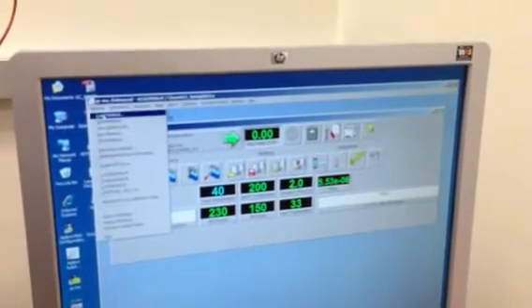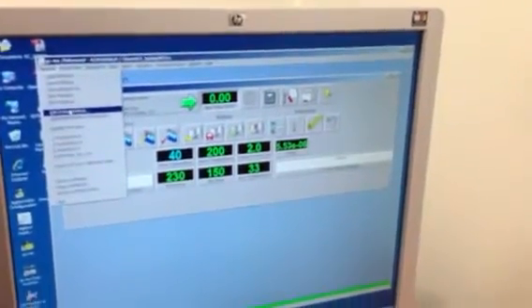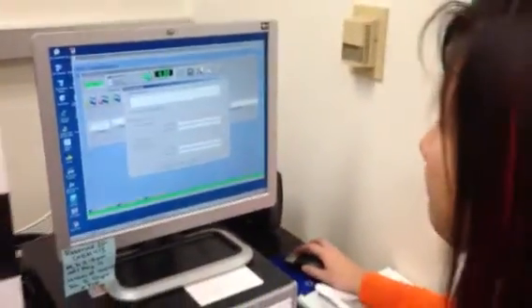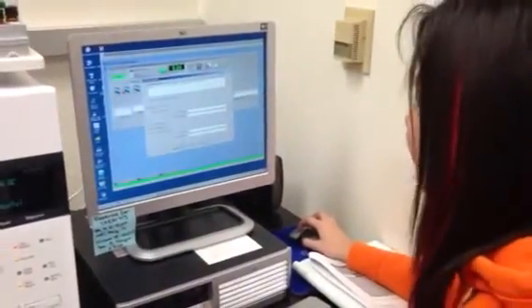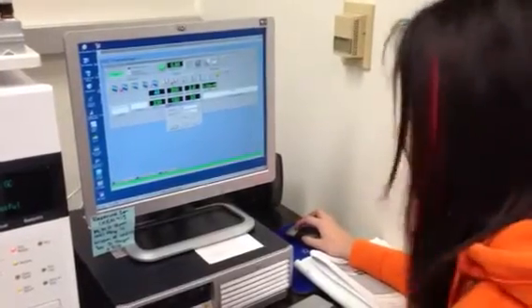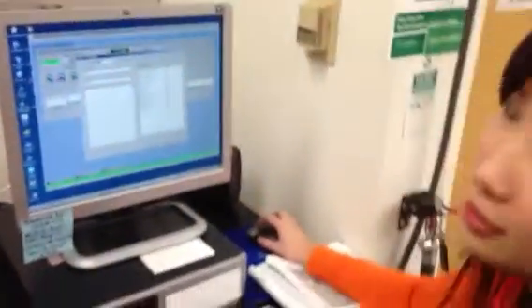The next thing you want to do is to edit your method. So you go down to Method, Edit Entire Method, and just click OK. Here you can make a comment for what your method is doing, otherwise just click OK. Here you can see what the instrument is doing for everything such as the incubation temperature, incubation time, syringe temperature, and the run time — just to make sure you have selected the right method. Press OK.